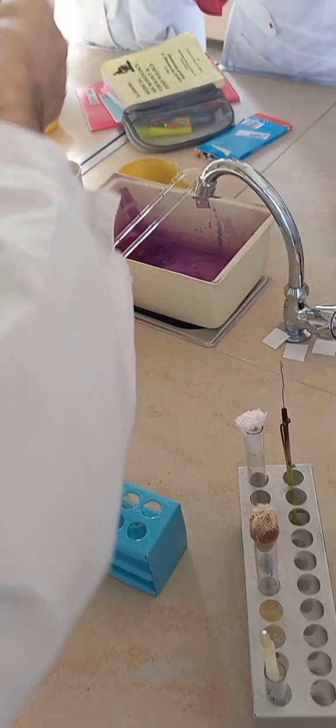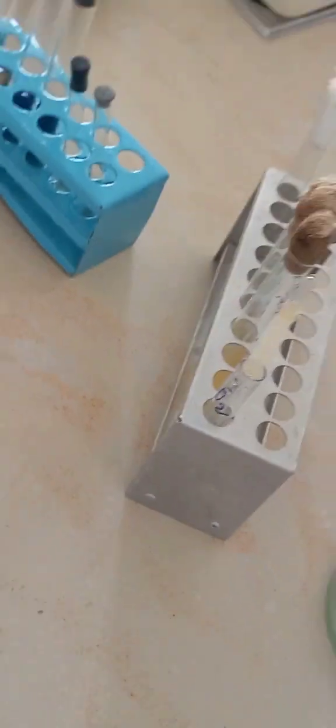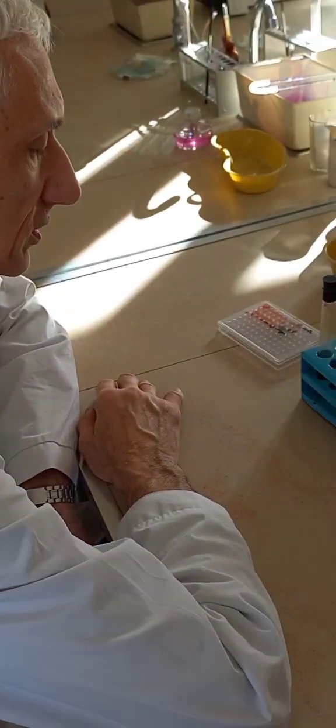So this is the first type of colony. At least this activity, really positive activity. This one, for colonies of the second type, not doubtful but weak activity. Okay, this is catalase activity, looking positive with various amplitude, but positive in both.